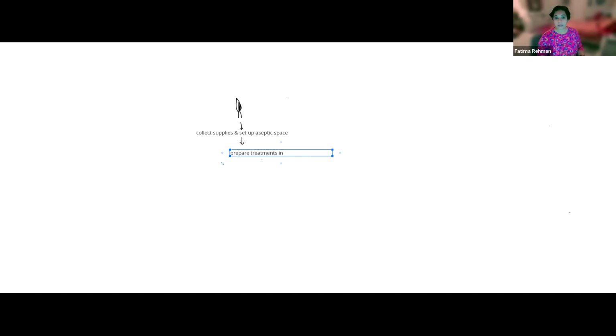But we only need to prepare for one plate. So it's 3 ml of fresh media in 15 ml conical tubes. So you would have gotten today 9 ml in one tube. What you would do is take 2 extra tubes, right? I will actually draw that out so you see it.